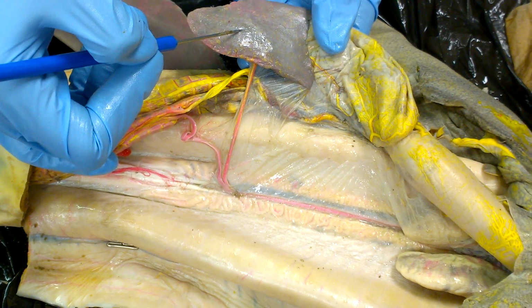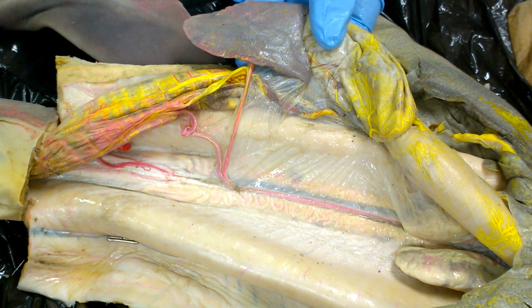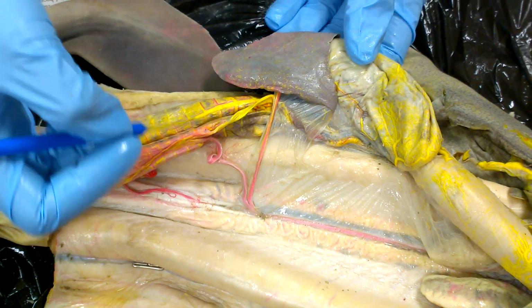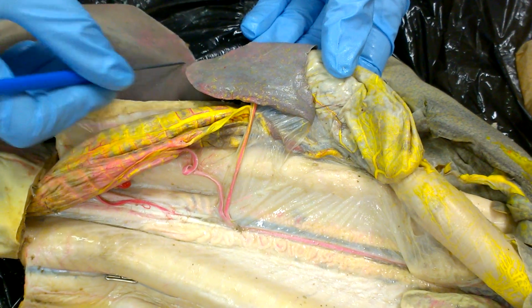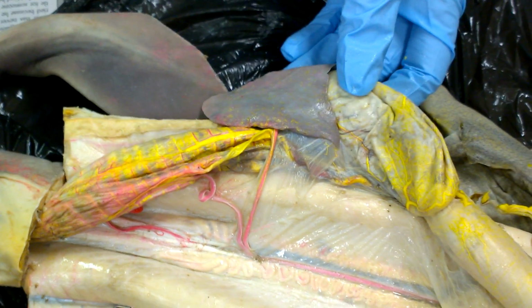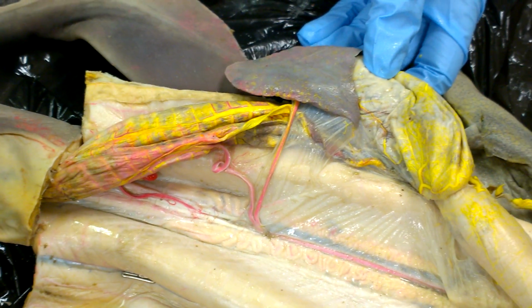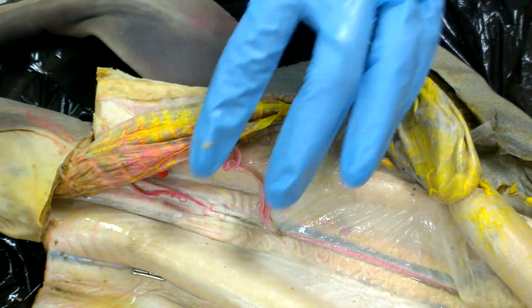Then we've got this branch that branches off and runs. What's this organ? Is that the spleen? Perfect. Splenic. Well, it's the gastrosplenic artery. Okay. It's kind of confusing. But if you ask, like, where does it take blood to, we wouldn't say anything with the stomach. No, it doesn't take blood to the stomach. I don't know why it's called that. It's just to the spleen, despite being called the gastrosplenic artery.